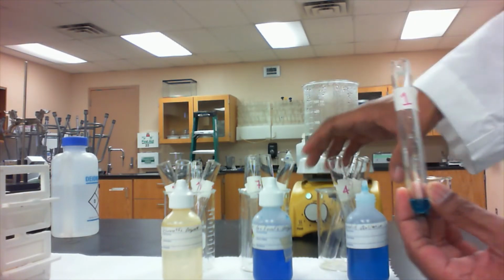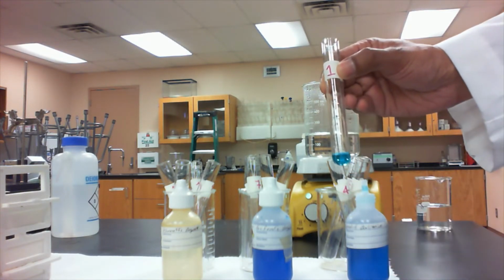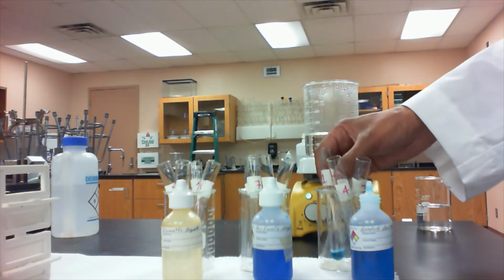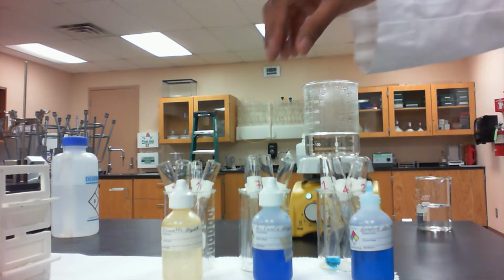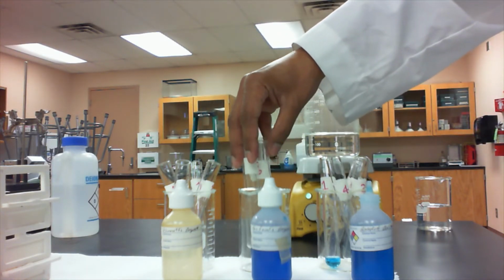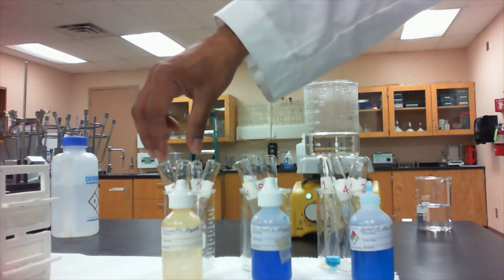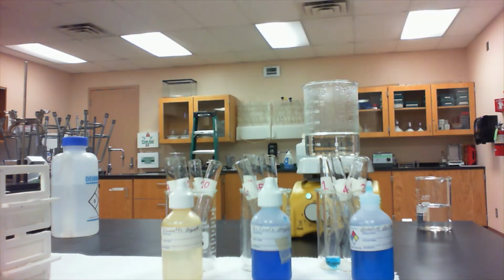So in my first group of 4, in test tube 1, I've already added 20 drops of my Benedict's reagent, and I'm going to repeat that for the other 3 test tubes in this group. Then I'll add 20 drops of my Barfoed's reagent into test tubes 5 through 8, and then 20 drops of the Seliwanoff's reagent in test tubes 9 through 12.